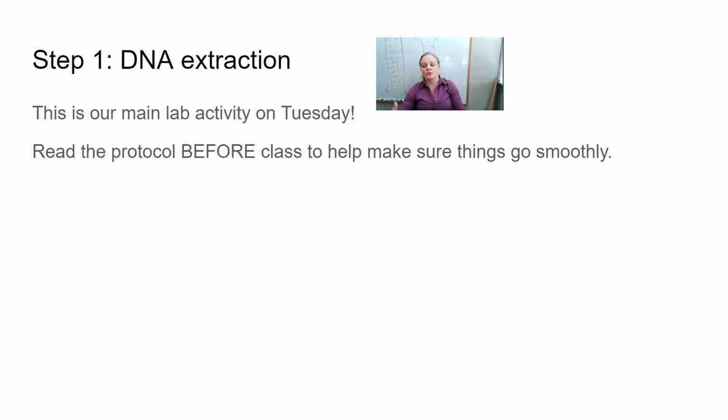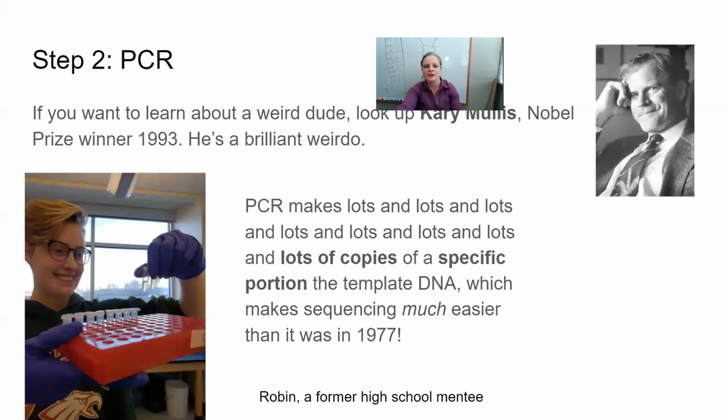Okay, let's go through these steps a little bit more slowly so we can understand them. For DNA extractions, we are going to actually do this tomorrow on Tuesday. So make sure that you read the protocol before you come to class and make sure that everything goes nice and smooth. That's on Canvas already for you.